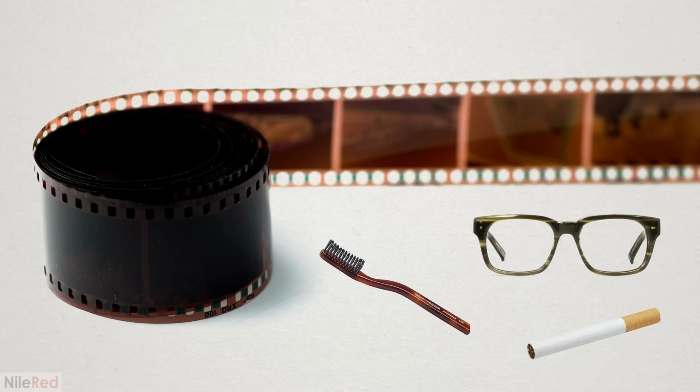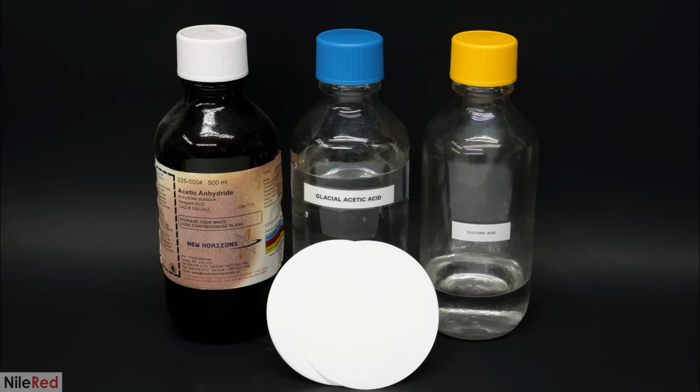Still though, I thought it would be something interesting to explore, so for this video I'm going to be making both types and testing out some of their properties. In terms of supplies, I'll be needing acetic anhydride, acetic acid, sulfuric acid, and a source of cellulose. I'm just going to be using filter paper, but in theory it's also possible to use cotton balls or something else.